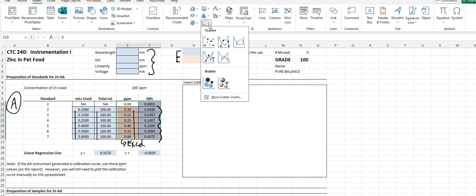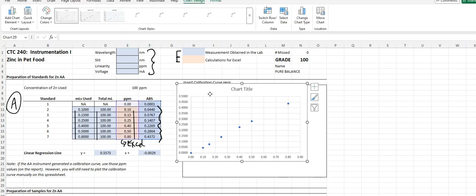There's the spots only, the data points. A version where curvy lines connect everything. Another version where it's just curvy lines and no points. And then another version where it's straight lines that connect everything. And then straight lines with no points. So like usual, we always go to scatter plot, and this is what we get.